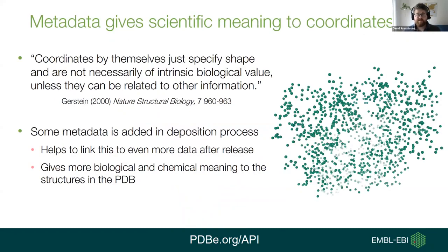So one of the big benefits of doing all this additional linking data is we can provide more broad information about the science behind those entries, and it enables us to link biological and chemical information to what are inherently just a set of atomic coordinates in the PDBe archive file.